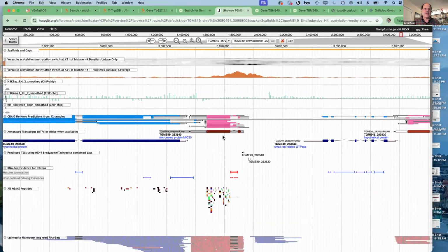So I'm guessing that this gene was flagged for consideration as to whether there might be an additional exon that should be annotated in an alternative transcript. And to reiterate, the evidence supports that there really are transcripts that include this exon, which then could not be translated.